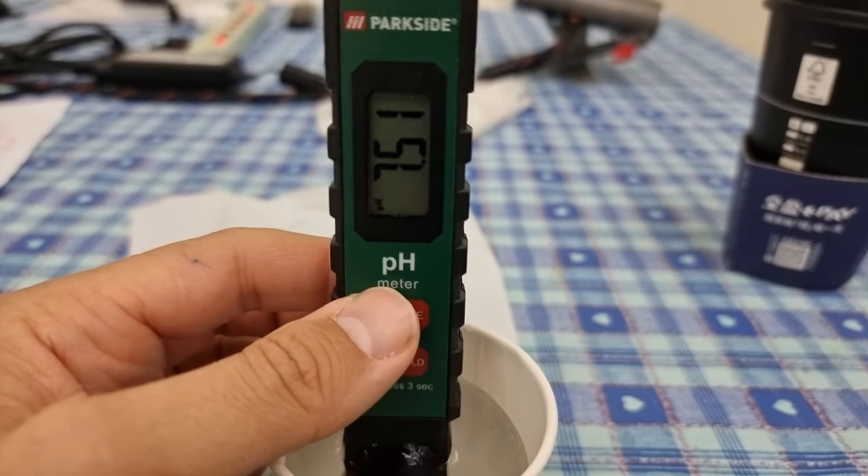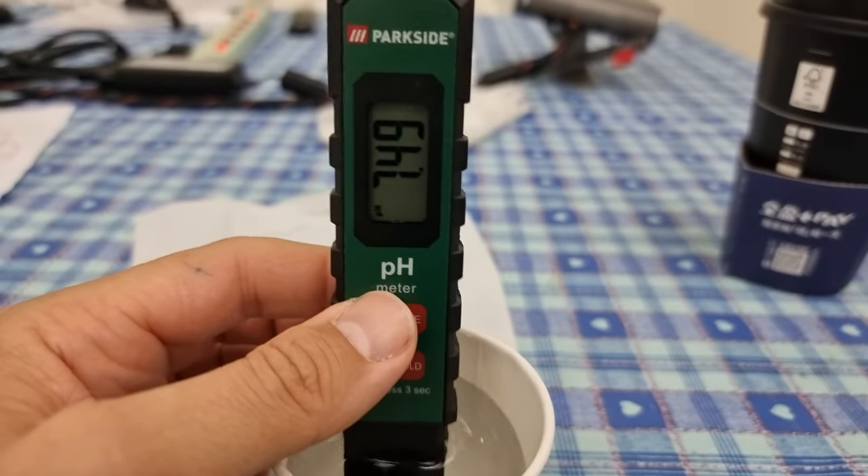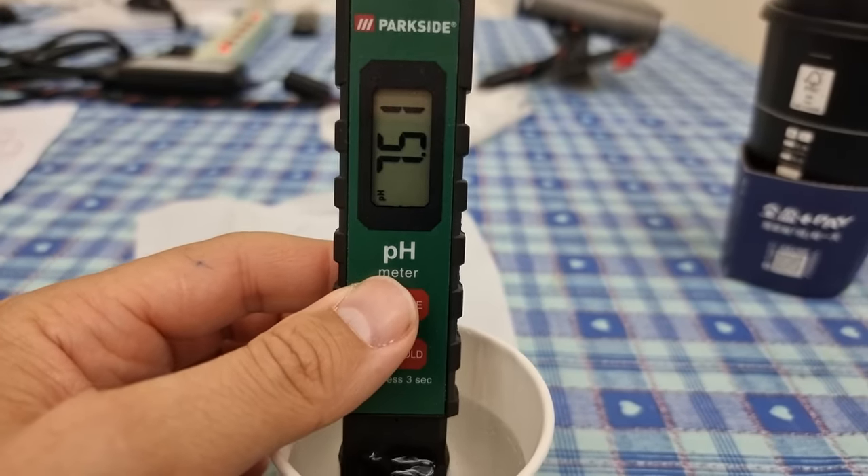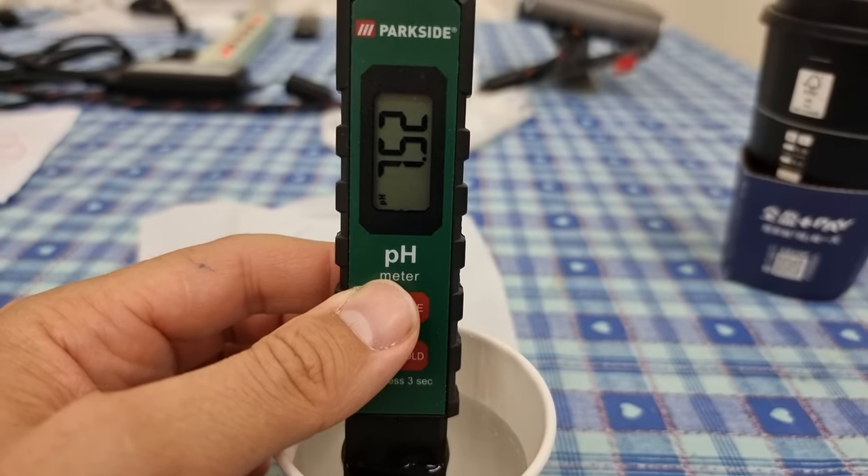So there is definitely an increase in alkalinity. This should settle at some point here in a minute. Settling around about 7.5, 7.512.